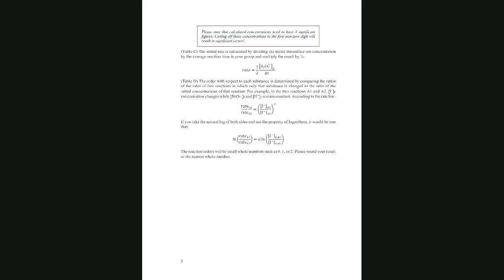All you have to do is the average time and the initial rate using the formula that is given here, this formula. And now will come the time that we will have to divide one over the other. I will share. Somebody has a specific question, or should I continue?